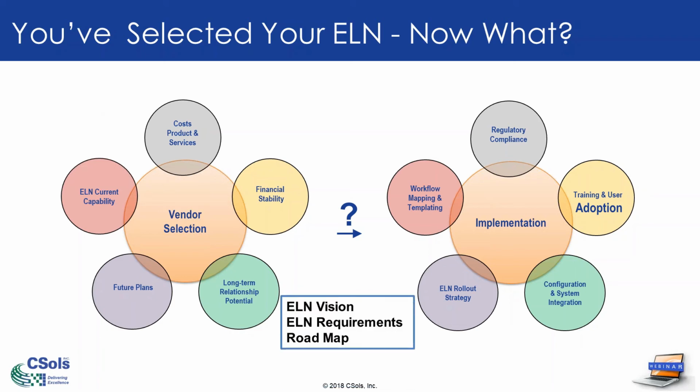If you have gone through a formal vendor selection process, then most likely you will have created an ELN vision. So what is the vision? The vision is where you want to be when you have finished your implementation activities. And when I say implementation activities, this doesn't necessarily mean it is a single project.